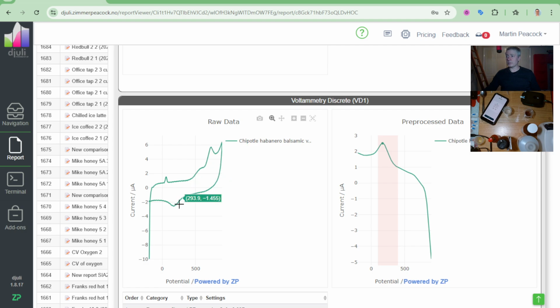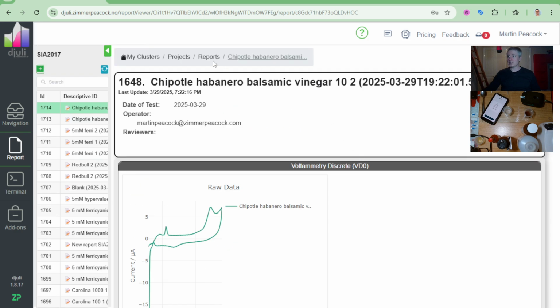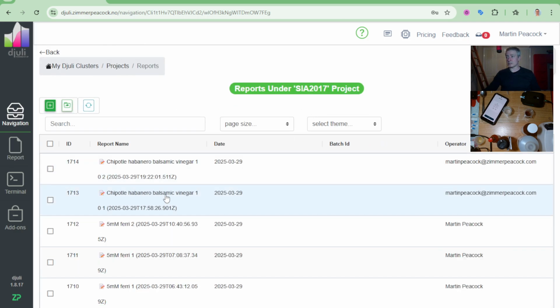I got peak 1, peak 2, and peak 3. So this is the fingerprint for capsaicin. I can see the raw signal. I get my result here, 1,530 Scoville heat units. As I said, I did it earlier on as well. So I've done it in duplicate, and I got 1,600 there.